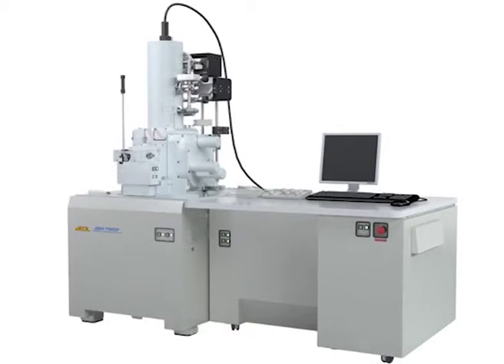This technique is used to characterize the morphology and elemental composition of paint samples. In this process, an electron beam impinges over a selected area of the sample, producing emission of various signals including X-rays, backscattered electrons or secondary electrons. The emitted X-rays produce information regarding the presence of specific elements, while electron signals produce compositional and topographical visualization.